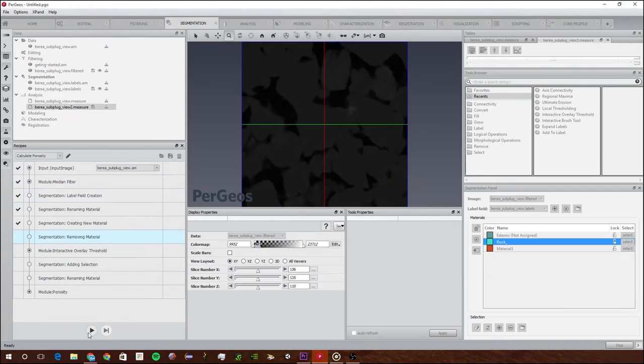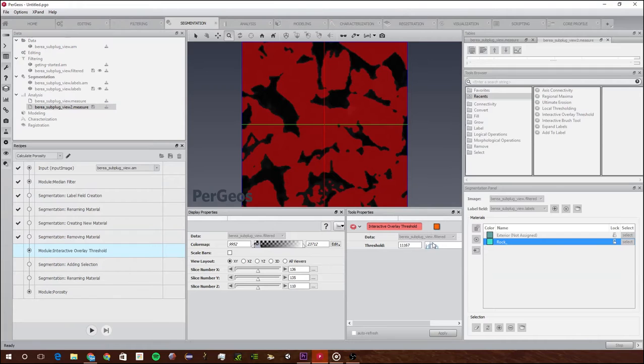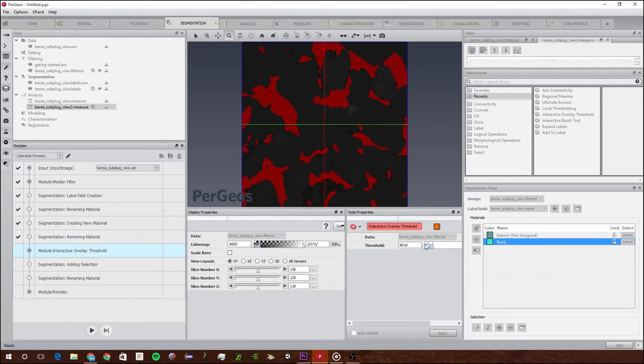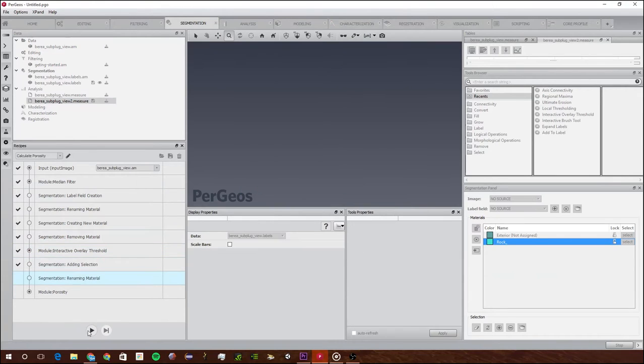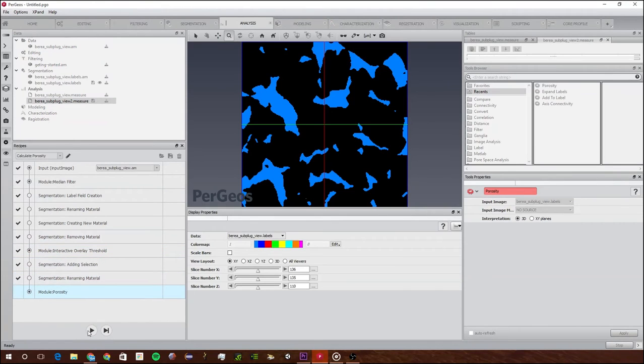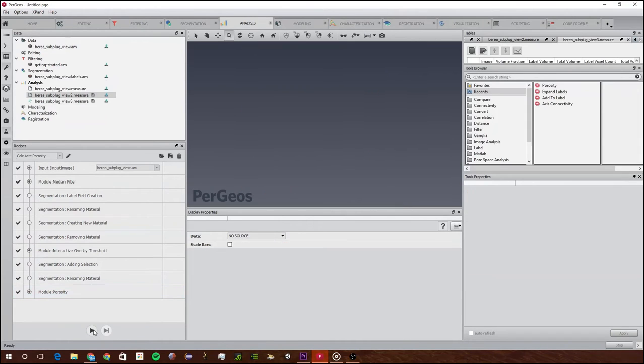It goes through the steps and now in the interactive overlay threshold I can change this to maybe view the other side like this. Then I can just keep it going. I can change this to the interpretation 3D or XY. I'm just going to change it to XY for this example and it keeps going on and creates a new one.